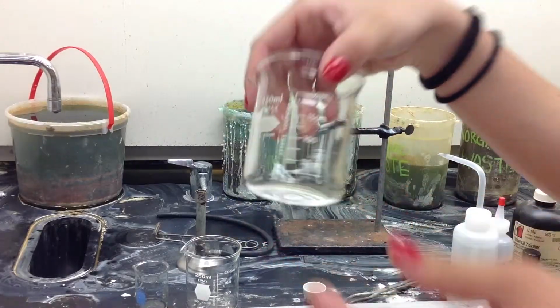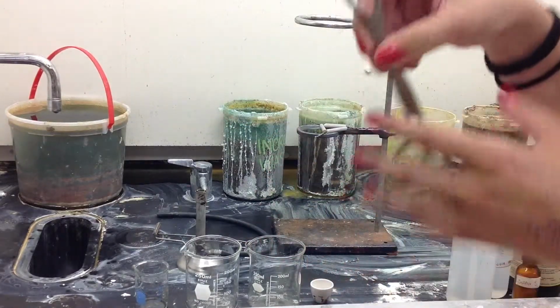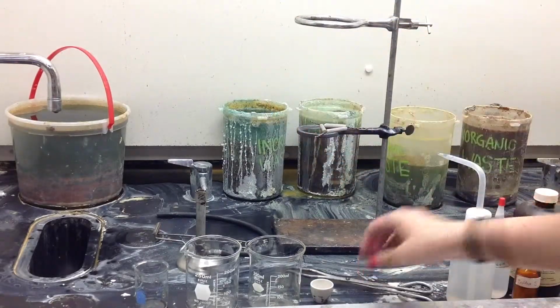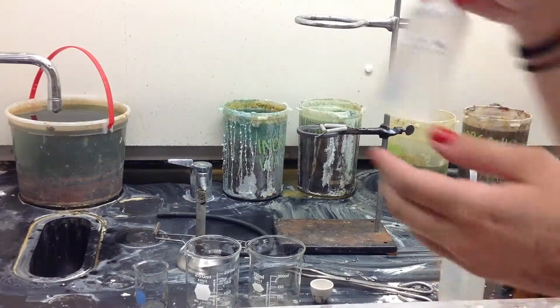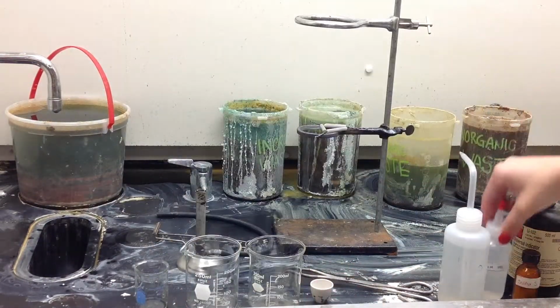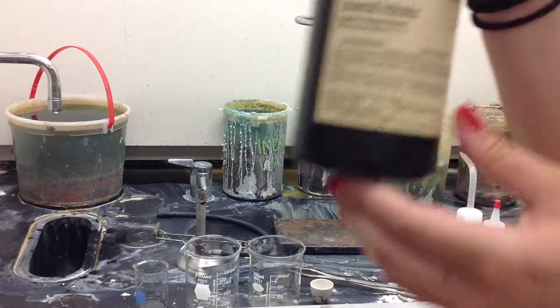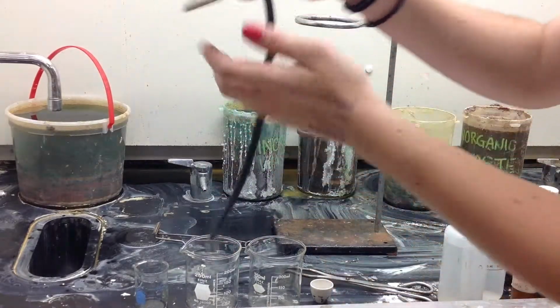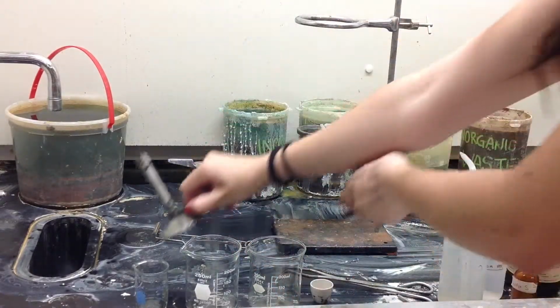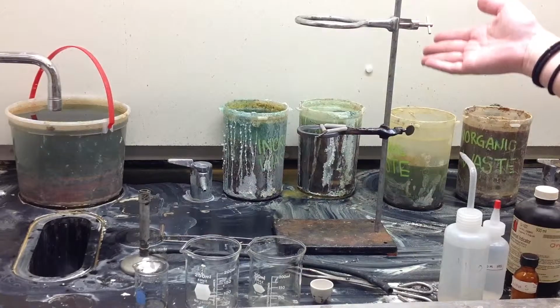For this experiment, we will need 3 beakers, a crucible, tongs, distilled water (ignore this), any acid, in this case I have hydrochloric acid, sulfur, universal indicator, a pipette, a Bunsen burner, a striker, and a fume hood.